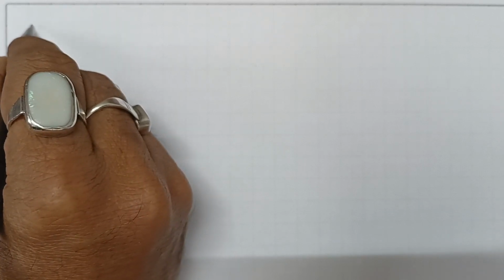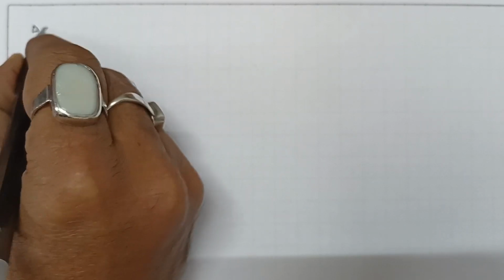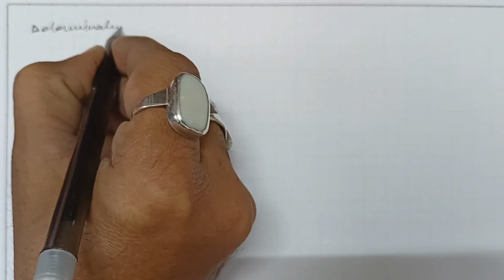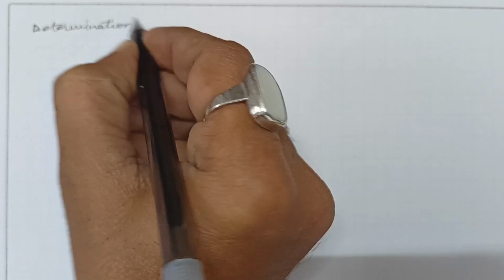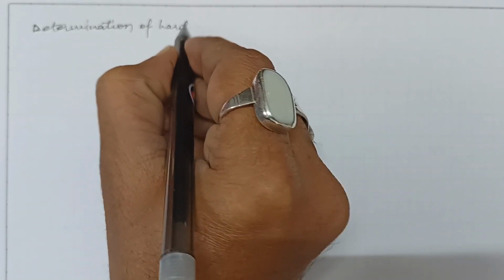In today's video lecture, we would like to discuss the determination of hardness of water in laboratory.